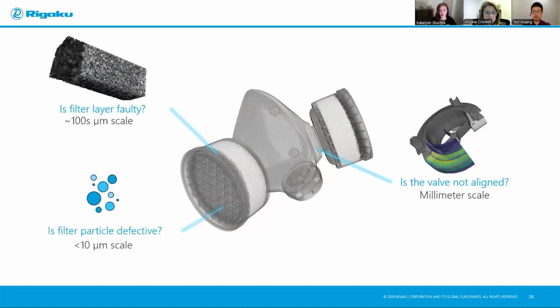For individual particles, we were also able to do that with CT, and all of them are 3D data. So they're not different kinds of data, where one is an image, one is a peak, one is spectroscopy. You can still do those if you need to, but CT serves as a very good top-down, comprehensive, wide-scale coverage for you to start, or even just solve your problem altogether if you can already see something's wrong.